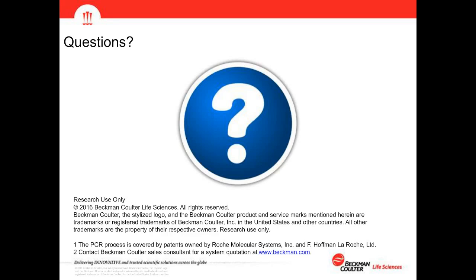Yeah, cellular workflows, sterility, again, is a big concern for a lot of our customers. And there's two different approaches, basically. It all depends on the actual size of the instrumentation you are using. So if we're down to a very streamlined, simple B4K that's used for some basic liquid handling tasks in a cellular process, you can probably put that in a classical BSL-2 laminar flow hood.